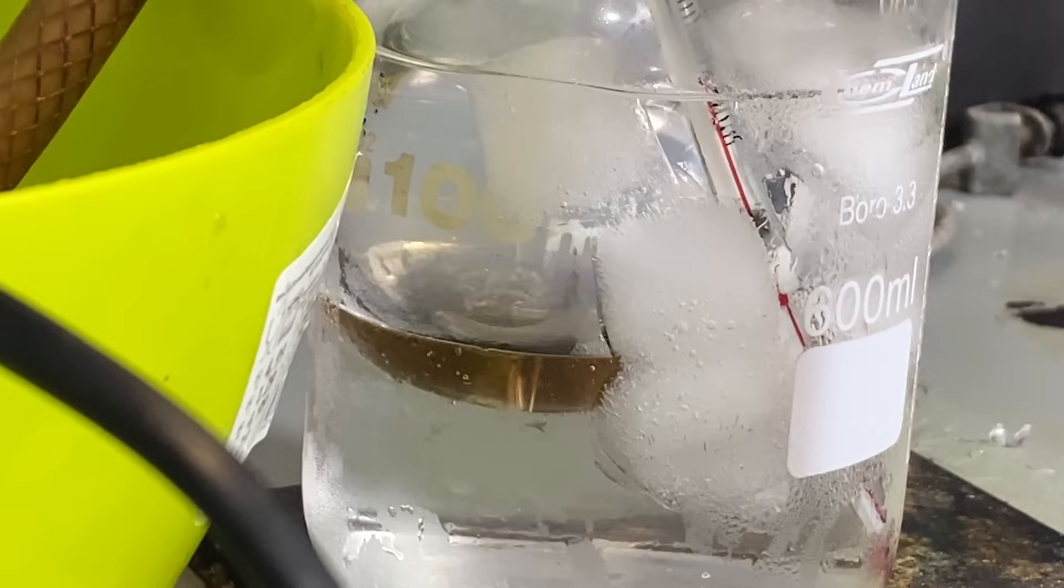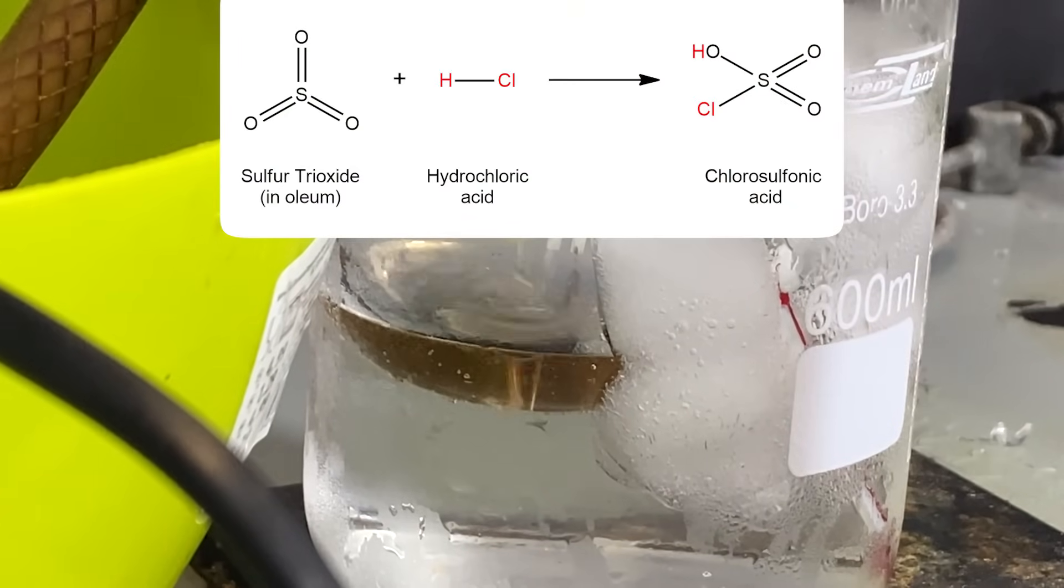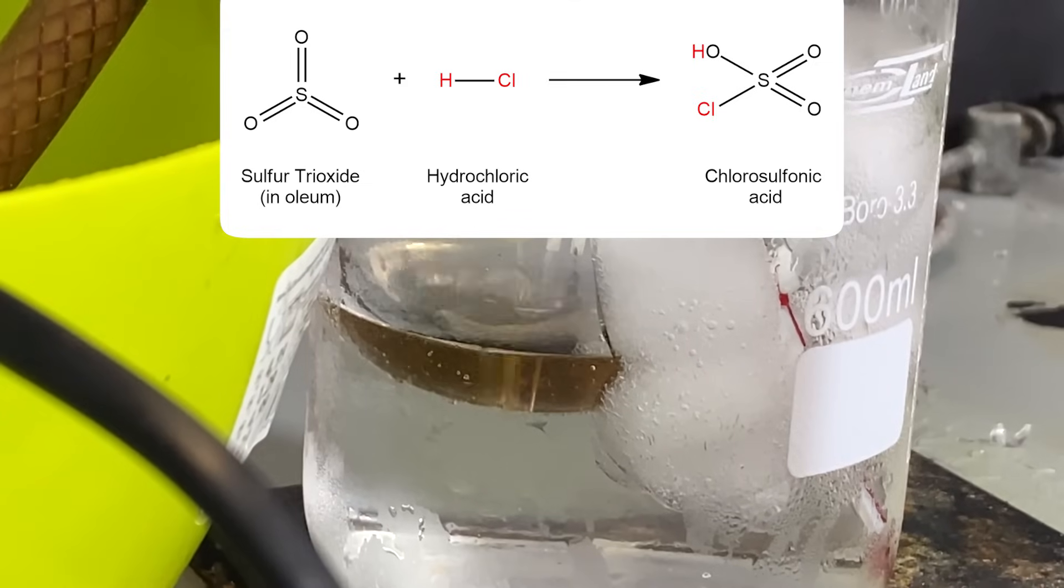And you can almost immediately see a dense white fog over the oleum. In this reaction, we are basically combining the SO₃, which is dissolved in the sulfuric acid, with HCl to form chlorosulfonic acid.